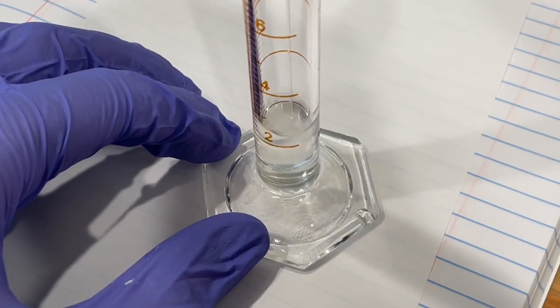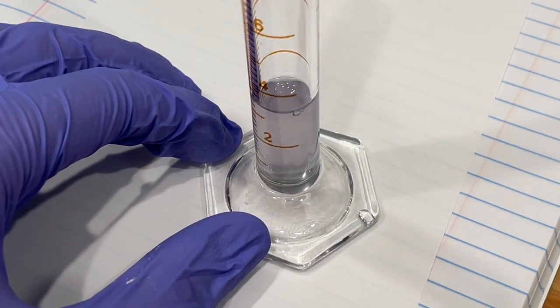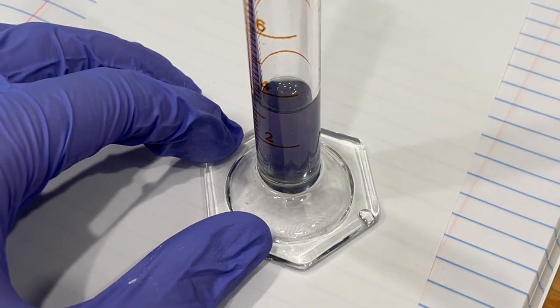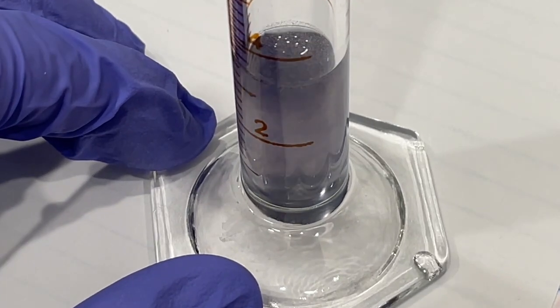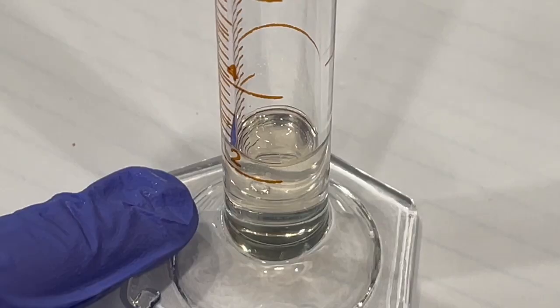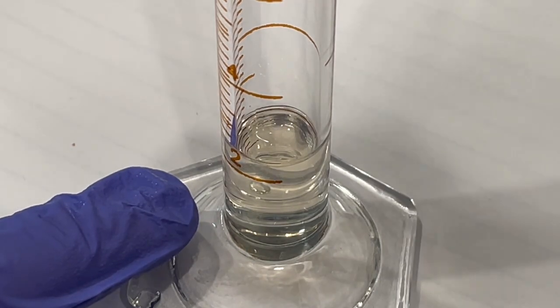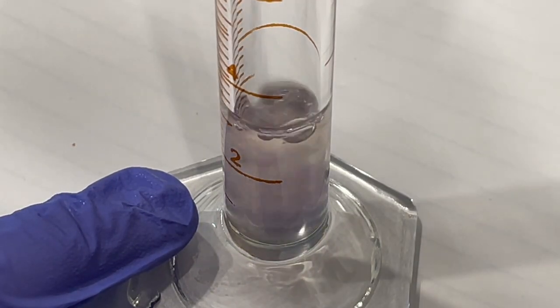In this example, we see oscillations that are slow and do change color. Finally, in this example, we see the color change occur, but after only a couple oscillations, the reaction stops.